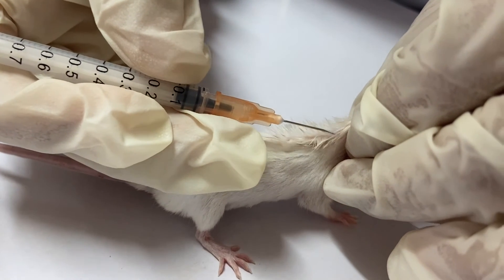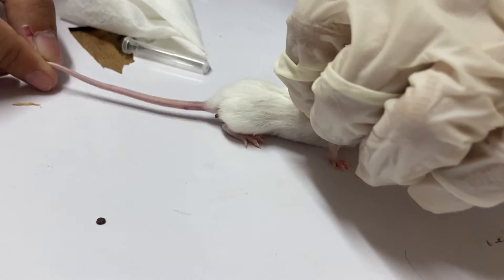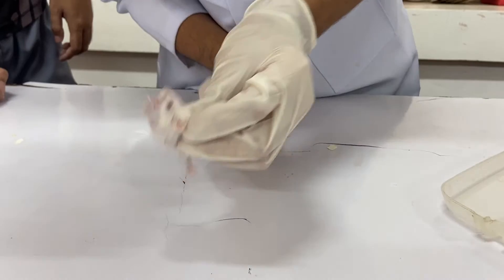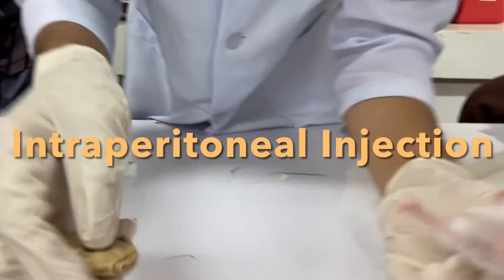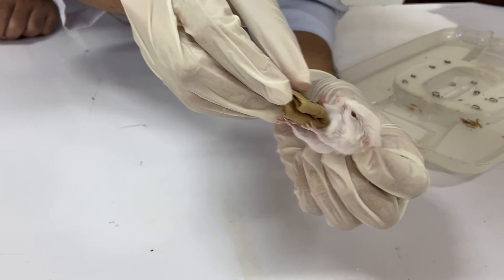Aspirate or pull the plunger before making the injection. Inject the solution slowly. After injection, withdraw the needle. Restrain the mouse using the one-hand scruff method, then swab the injection site with a sterile pad with alcohol.